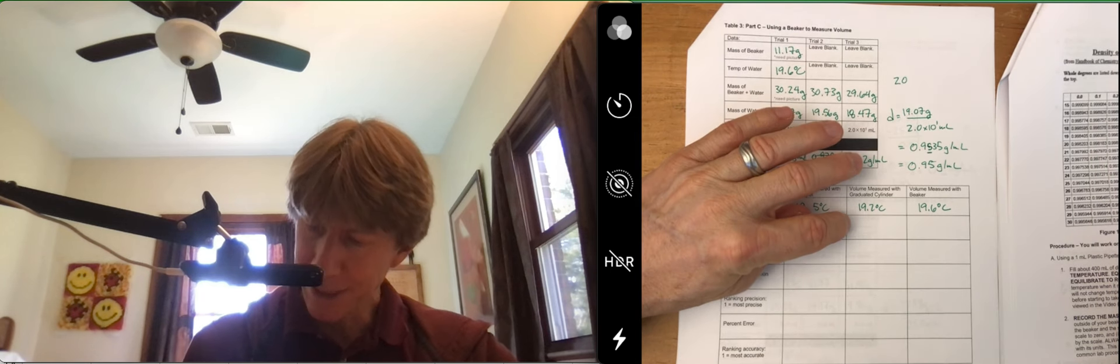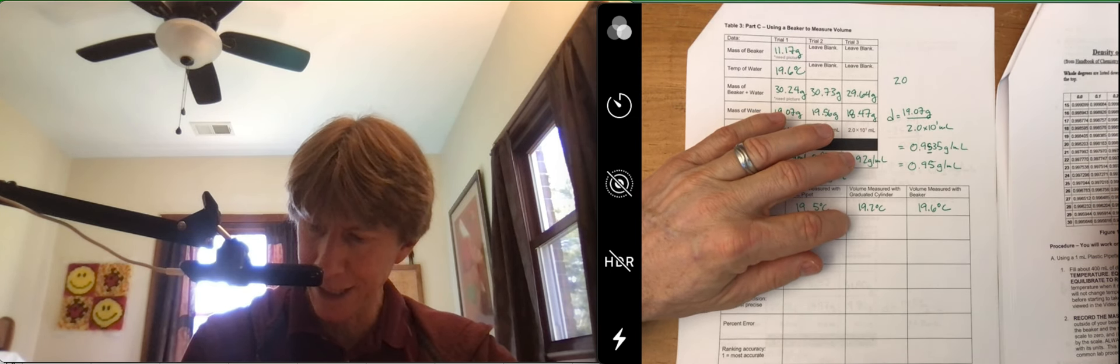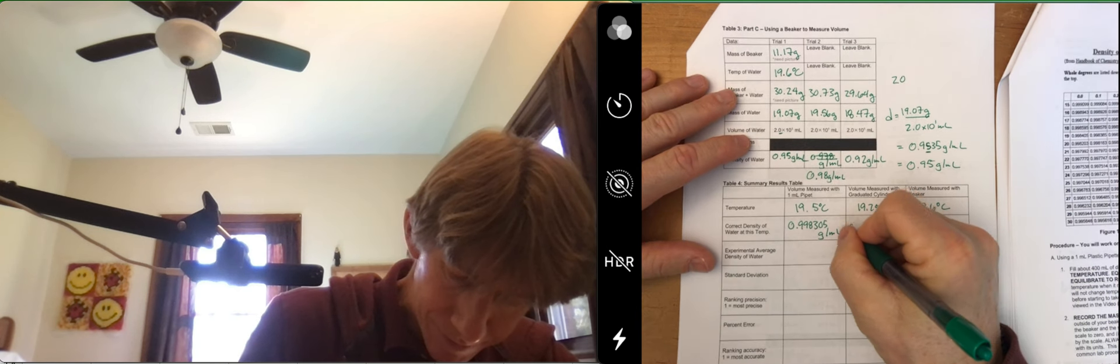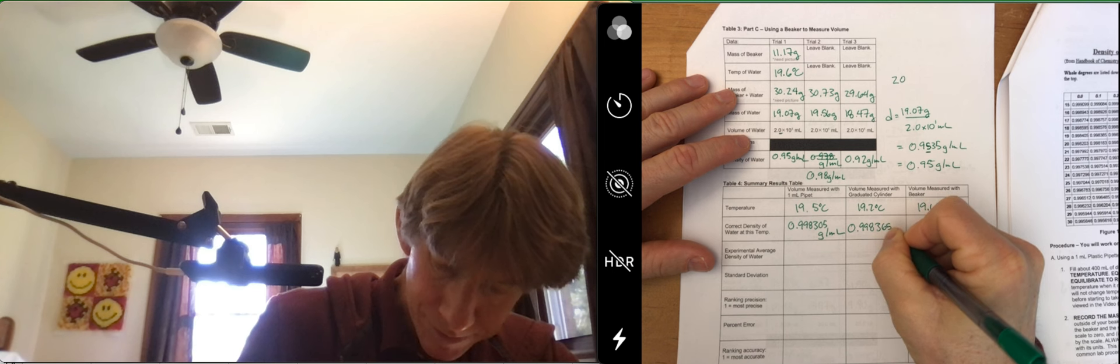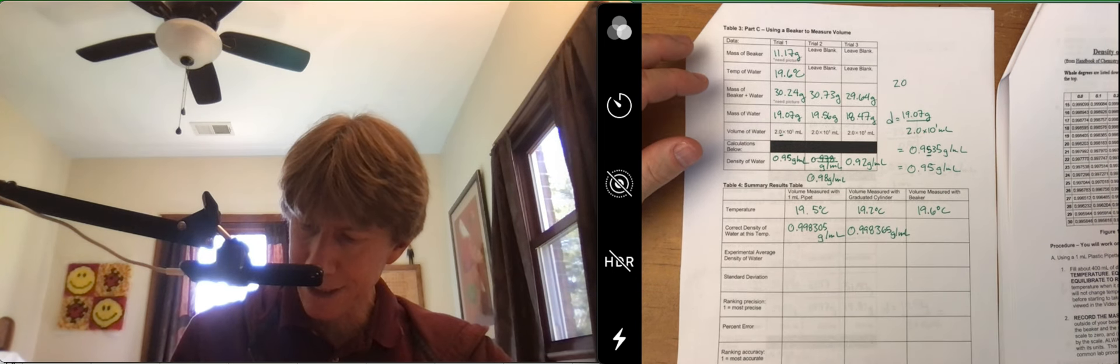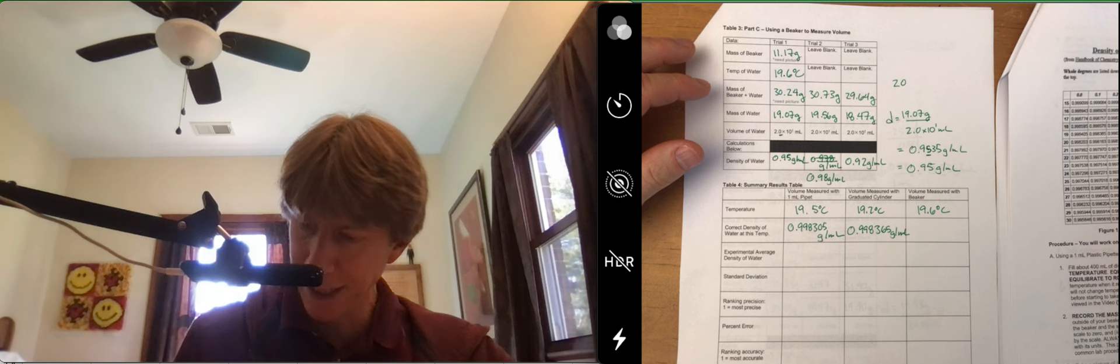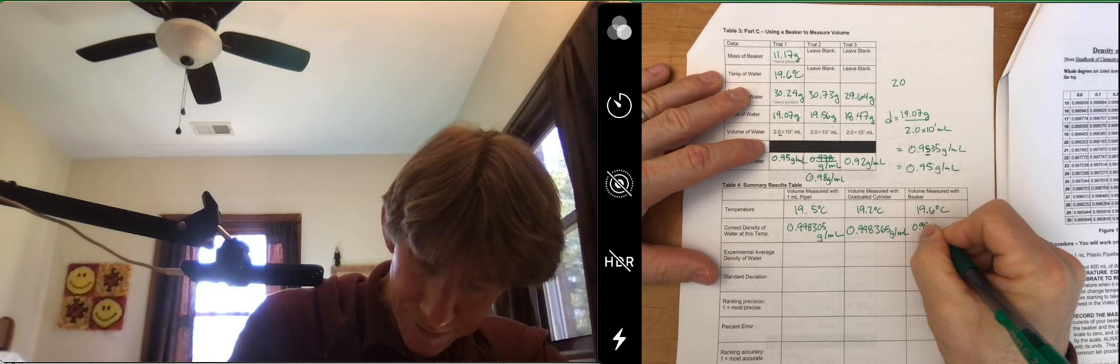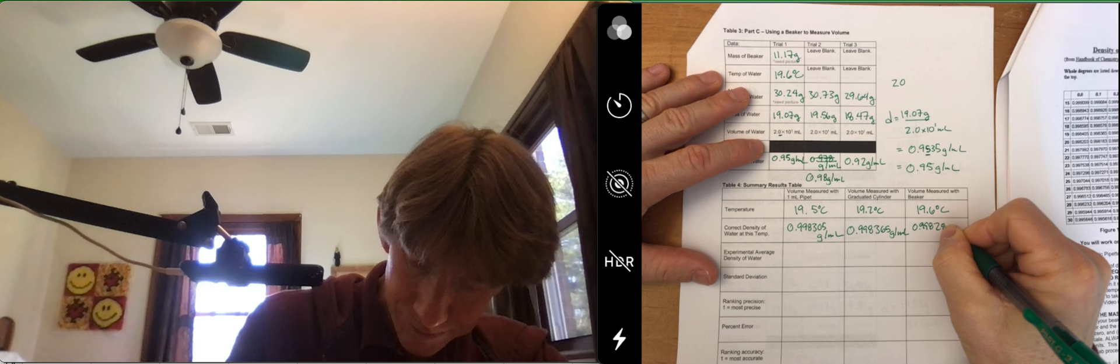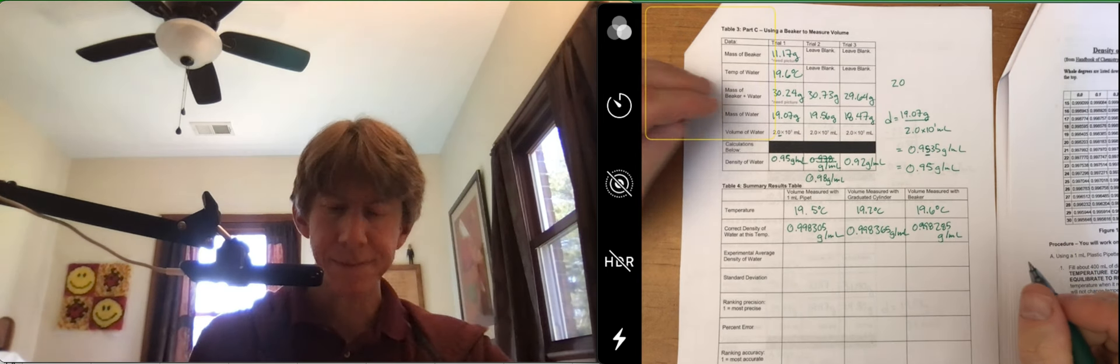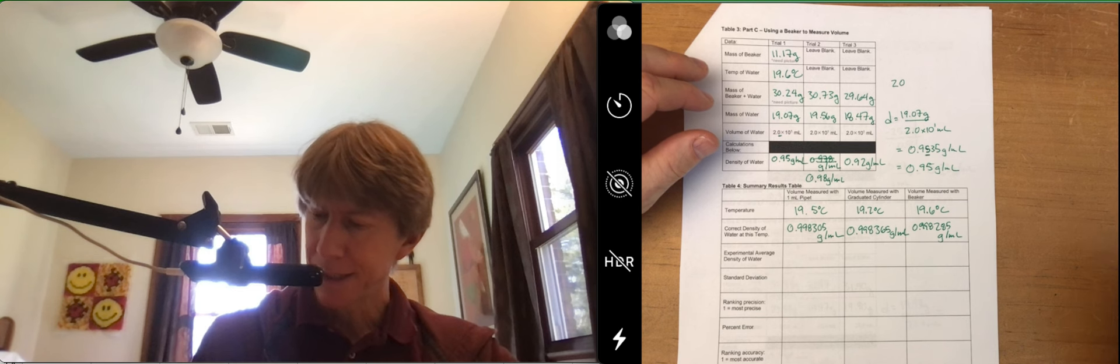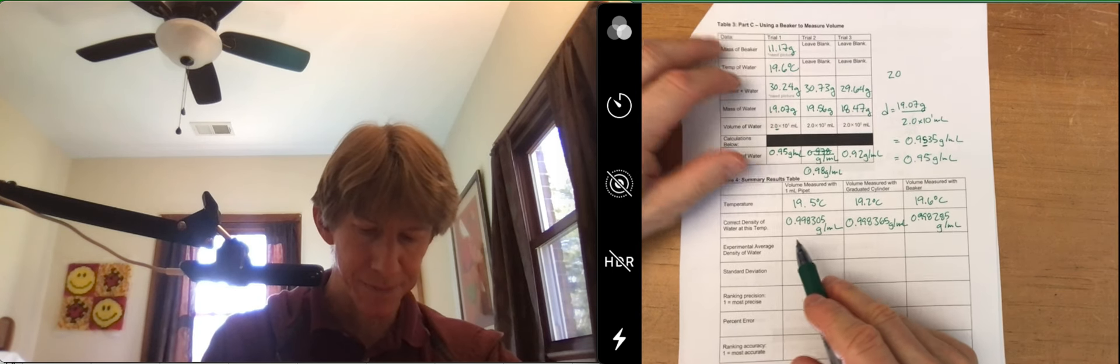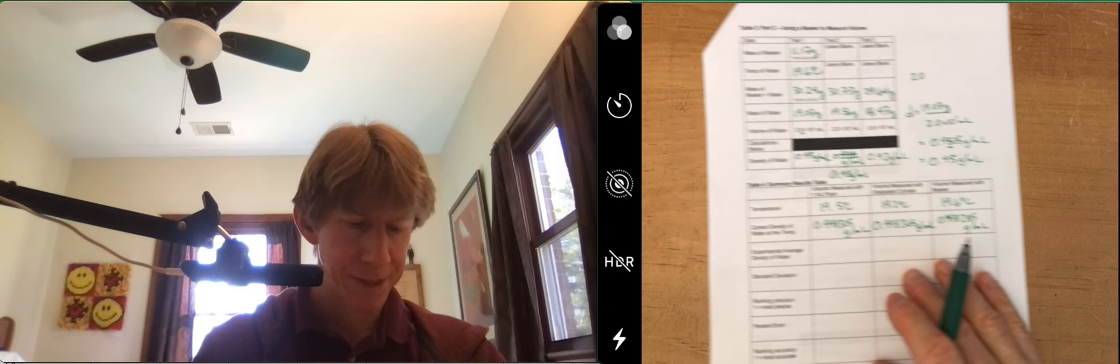At 19.2, I get 0.998365. And at 19.6, 0.998285. So second row done. Please make sure you have some of your temperatures exactly in there.